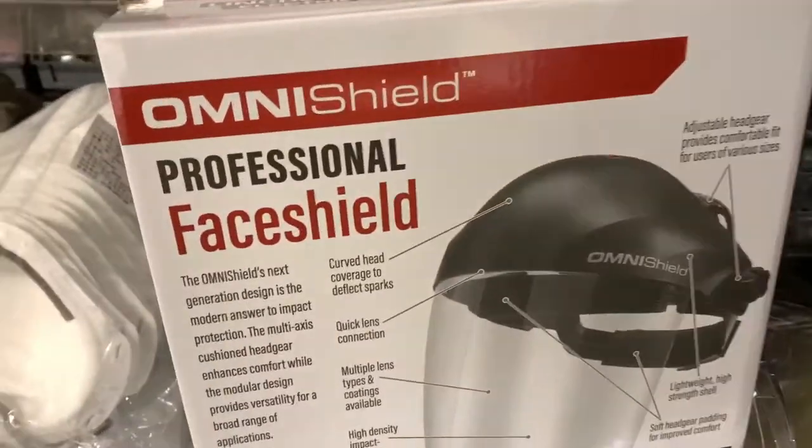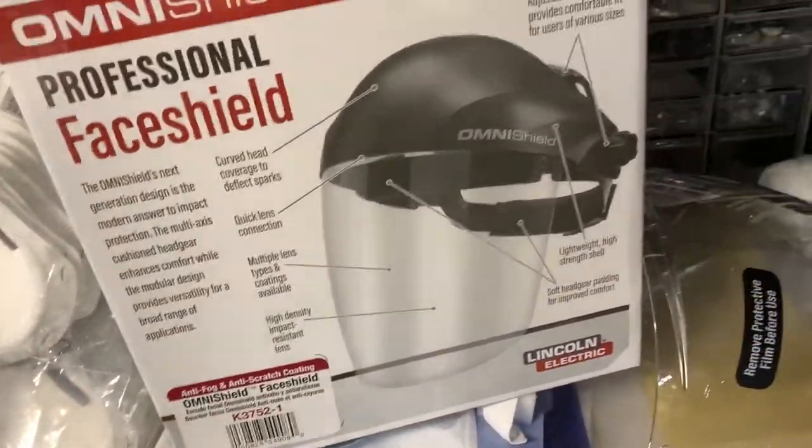I purchased the OmniShield Professional Face Shield. It comes in a number of different parts and we're going to put it together and try it out.